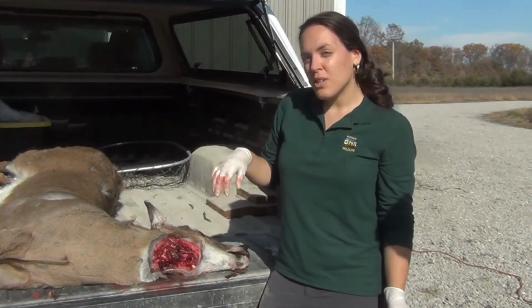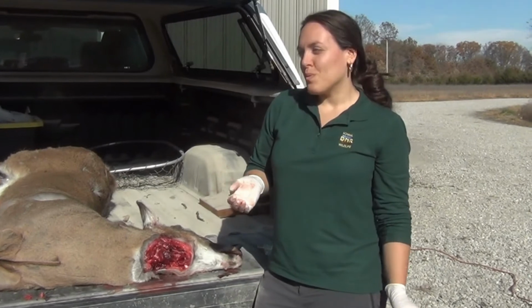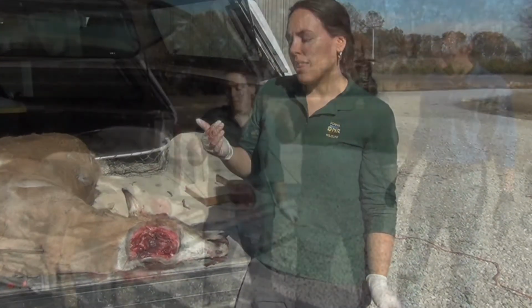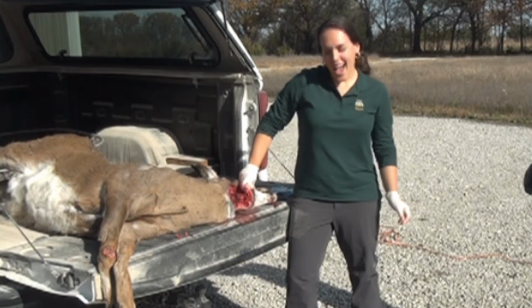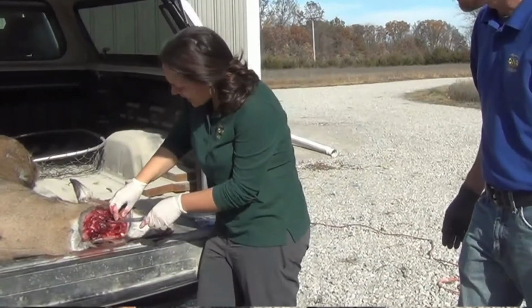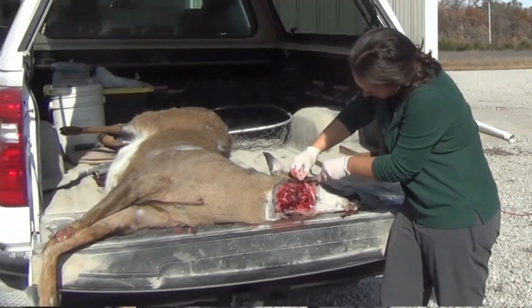They're not always visible. If you're wondering what I mean by a blueberry, it's actually called a hemal node, also sometimes called an accessory spleen. It's just another filtering organ, part of that lymphoid system that all animals have. So it's maybe not as impressive in this deer, just given the circumstances, but these would be the samples that we're looking for. So that one that Tyler was showing, and then this little lymph node here.